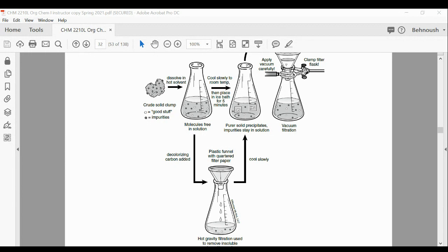Is it the one in which the product will be very soluble at high temperatures? The sample would be soluble at high temperature and? But it will be slightly soluble at room temperature or lower. Not soluble at room temperature, or very low solubility at room temperature or lower. Mm-hmm. Perfect. Okay, I wrote the note to myself, hopefully make it more clear.